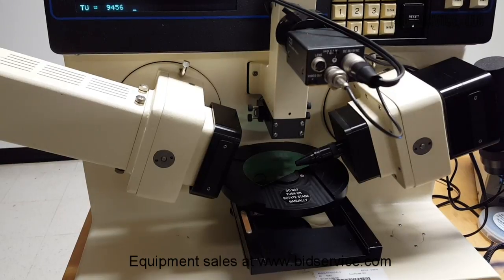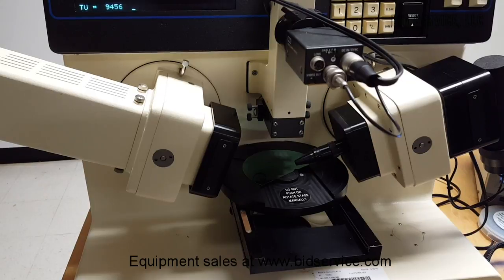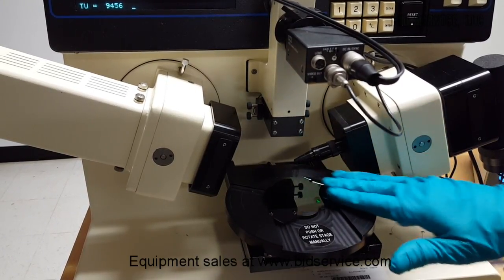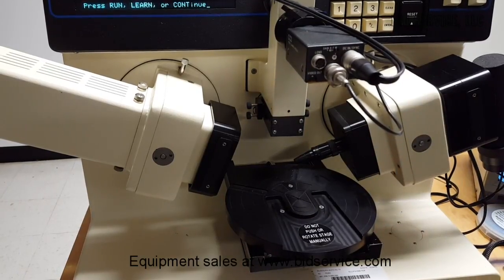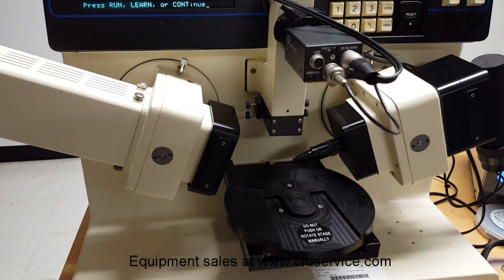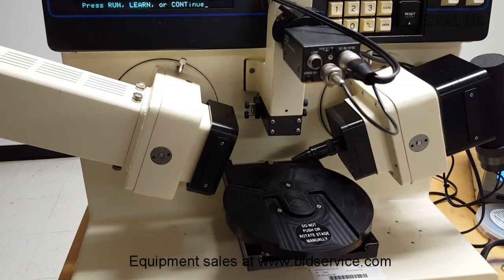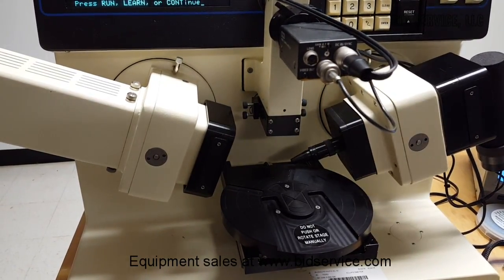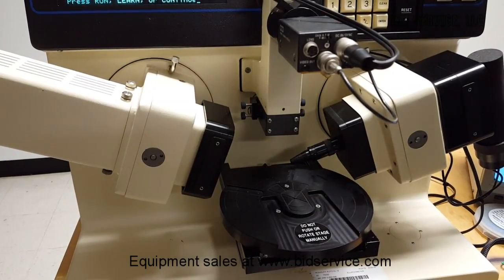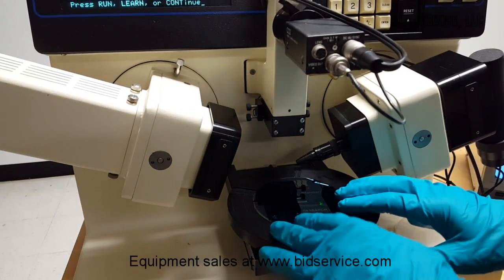So this standard is supposed to be approximately 9,470. So it's measuring around 9,456. I'm going to measure a sample here, which is silicon nitride. And let's see, the program number for this sample is 26, I'm going to use.